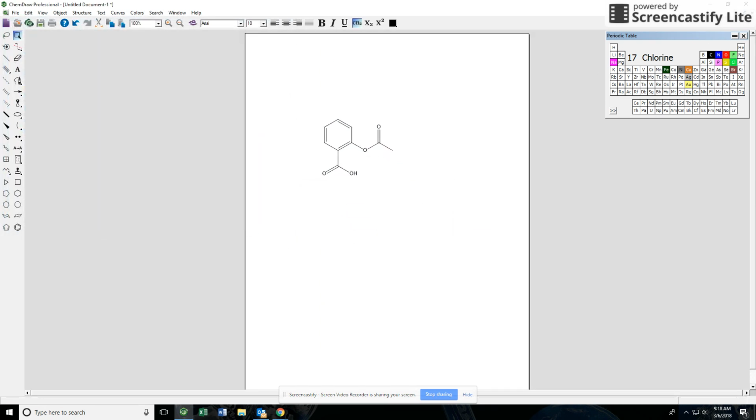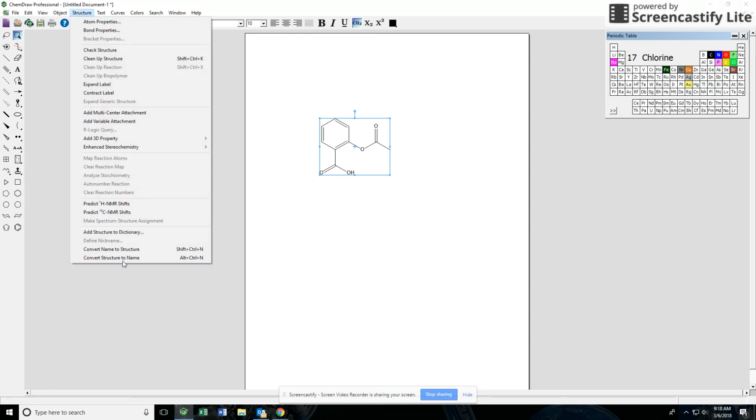All right. So draw your structure, structure to name, name to structure, predict NMR shifts here. That's going to help you guys interpret your NMRs. All right. Now, I'm going to give you guys a strong word of caution. I'm giving you guys a very powerful tool here to help with NMRs. Now, understand that NMR is going to show up on your exams.